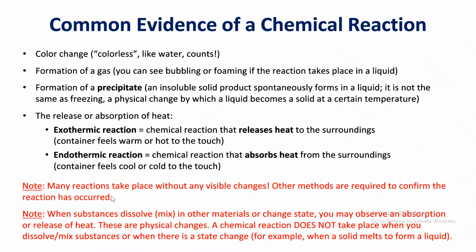Many reactions take place without any visible changes. Other methods are required to confirm that a reaction has occurred. This is something important to note. Another thing we want to note is that when you mix substances in other materials or change state, you may observe an absorption or release of heat. This will be considered a physical change.